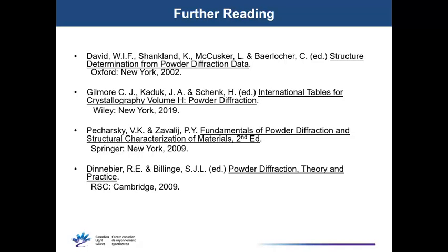Any more questions? So if someone is new to CLS, you showed lots of software packages. Which one does CLS staff support to help new users? GSAS-II. Yeah, GSAS-II. You'll know.